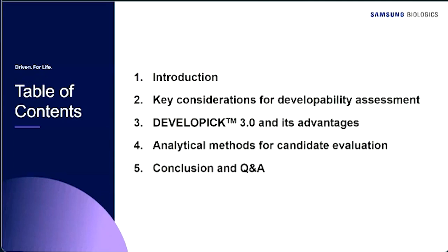Next, I will go over the analytical methods we used in DEVELOPICK 3.0 to evaluate molecules, including biophysical characterization, solubility testing, and sequence-based assessment. And then I will wrap up with the key takeaways and a Q&A session.